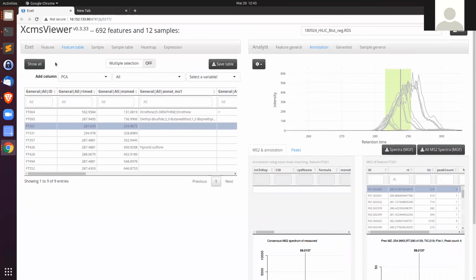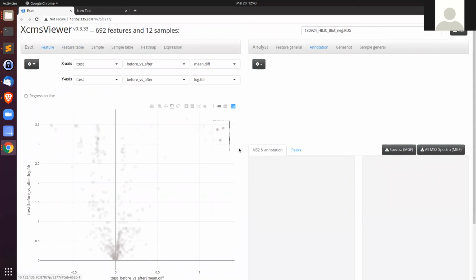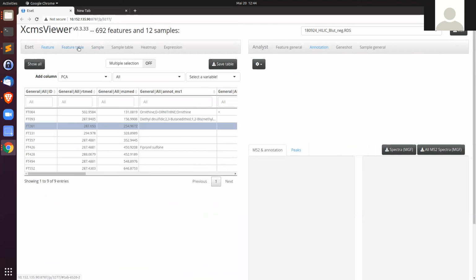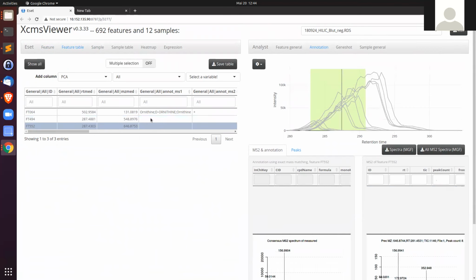But it's also interesting because it's just on the top right corner here. Is it one of the 3 here? I think this compound is very interesting, right? So you can see, yeah, that's it.